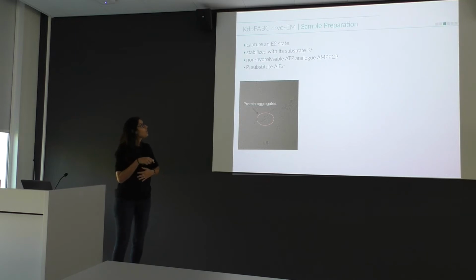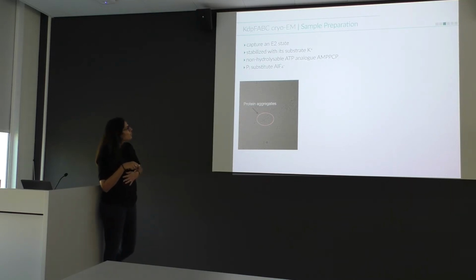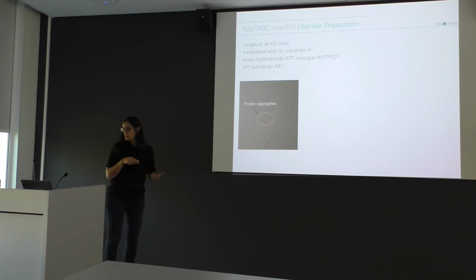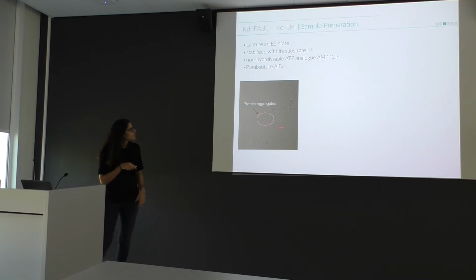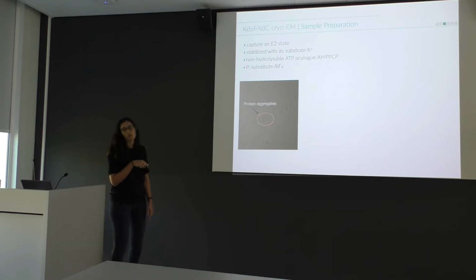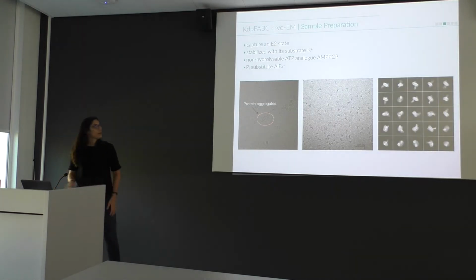At the beginning, as so often with cryo-EM work, we had some problems with sample preparation. We struggled for quite some time with what I always call microaggregates. You sometimes see some single proteins, but we really struggled with this. But we finally made it.